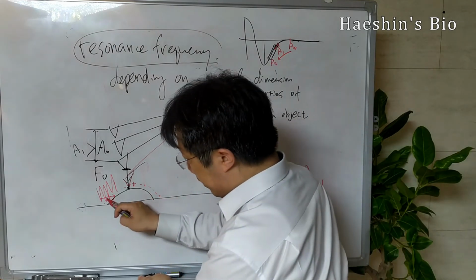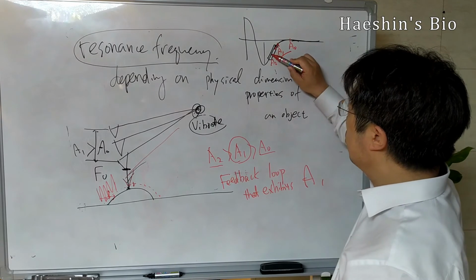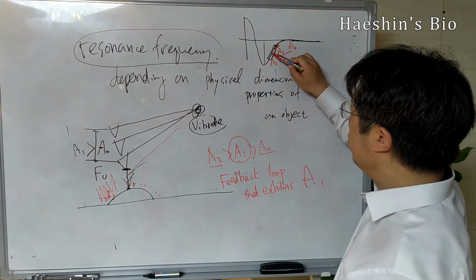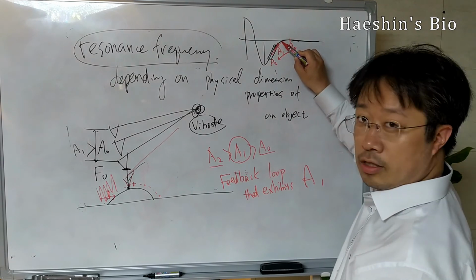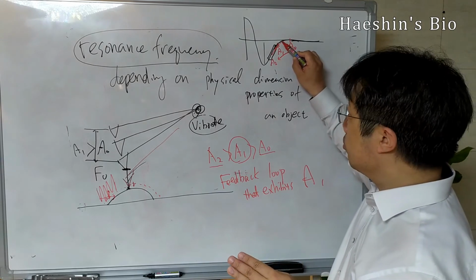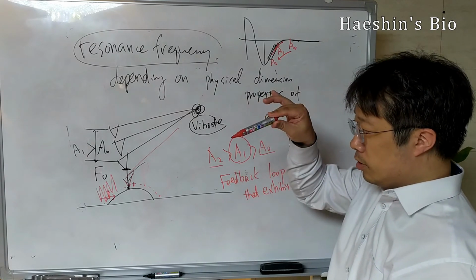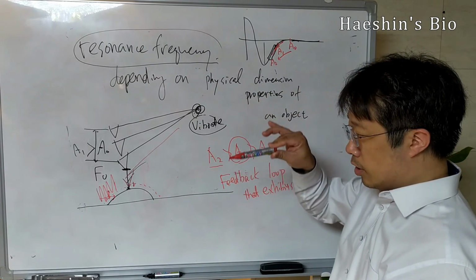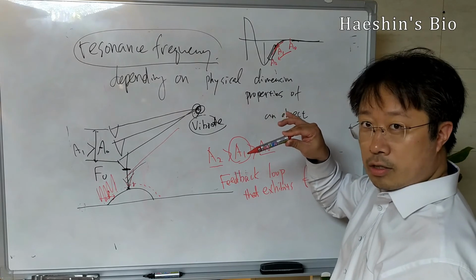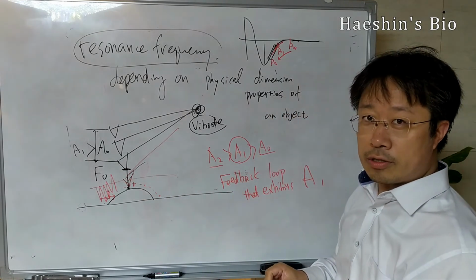probe system. So a little bit up, and then until it goes up, the amplitude will decrease. But I don't want too much decrease of the amplitude, so then it goes down. So they can keep vibrating. So this fixed point actually goes up and goes down, but they can see a constant amplitude like this as they move in this x direction.